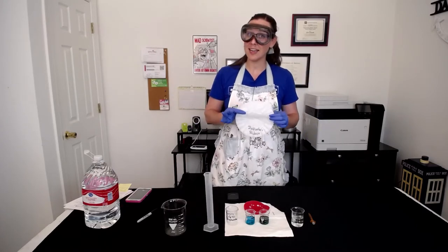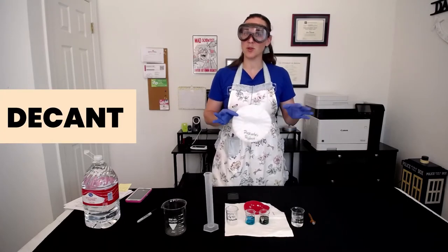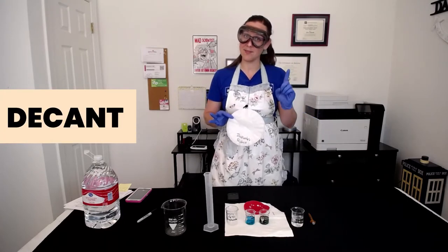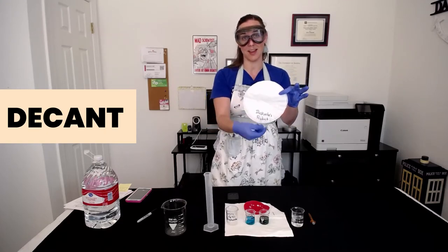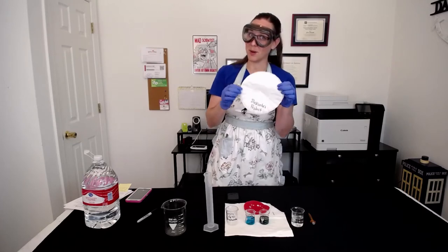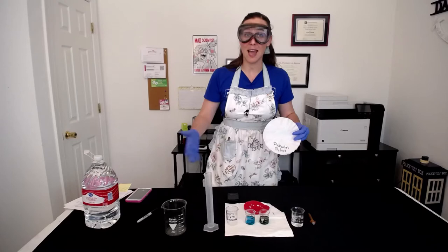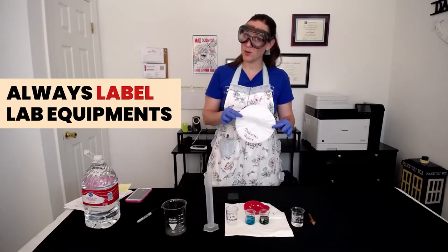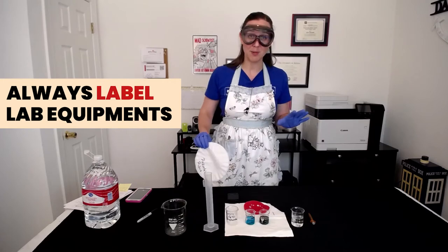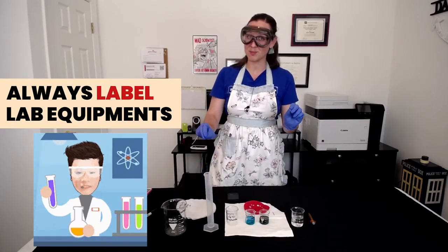In addition to figuring out whether iron 2 chloride or iron 3 chloride solution forms, we also want to figure out how much copper we can make from this reaction. So we're going to be collecting that copper that's plating off of the nail and massing it to see how much we get. In order to collect that copper product, we're going to need to decant — which means we're going to pour off the liquid and leave behind the solid — and also filter in order to make sure we don't lose any of our product. Make sure you have a filter paper with a label on it.